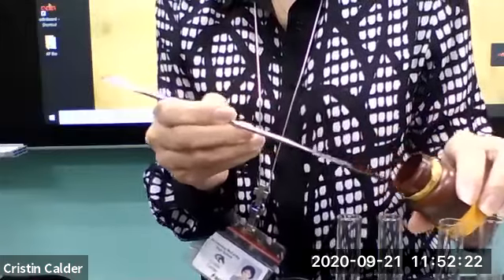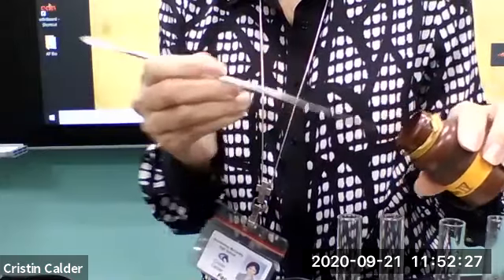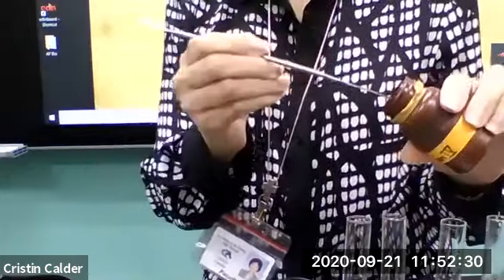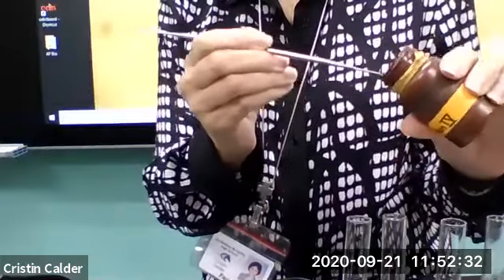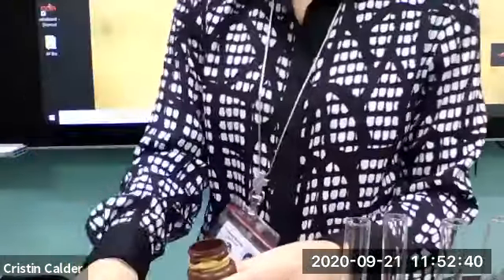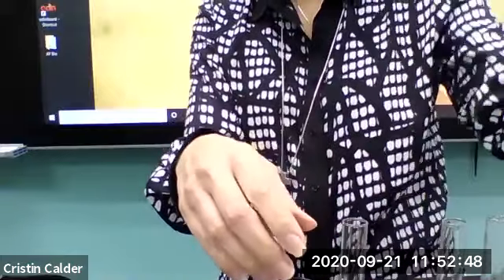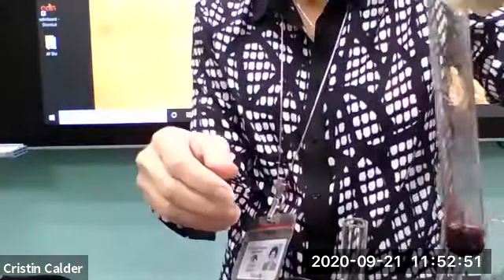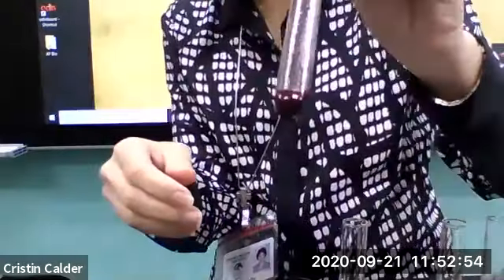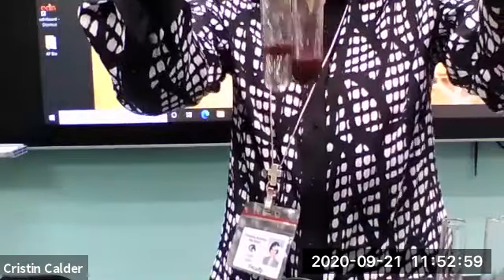So I don't know how well you can see this. This is a little bit of Sudan IV in tube number 1. Okay. So that's my Sudan IV. All right. So this is my Sudan IV in oil. I don't know how well you can see that, but it actually dissolves in the oil and turns the entire solution red. But in the water, it's actually insoluble.